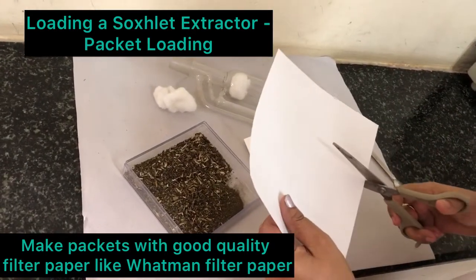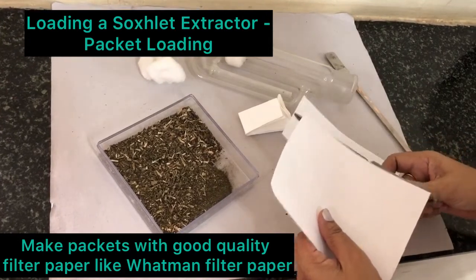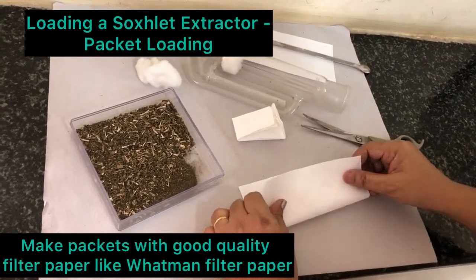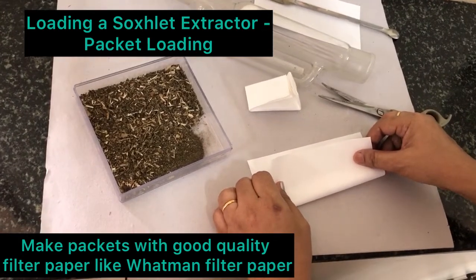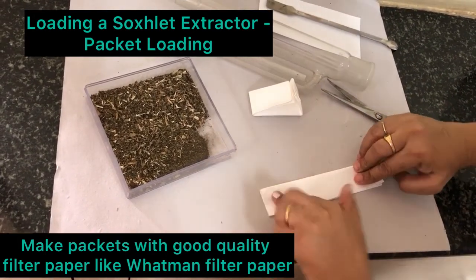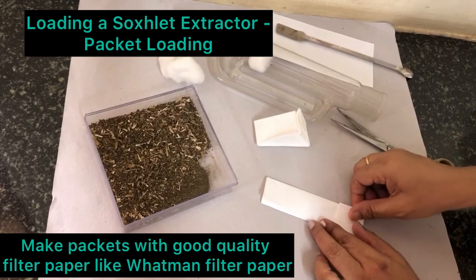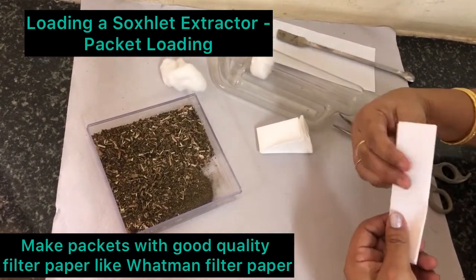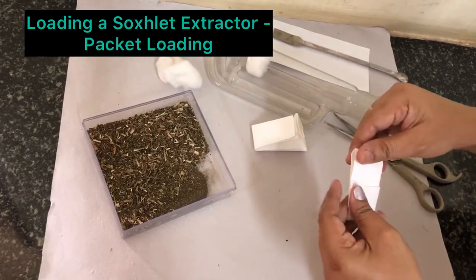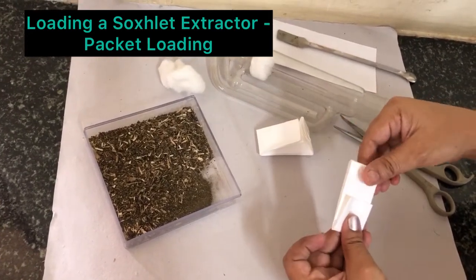You have to cut the filter paper. Keep it like this. Then fold another half like this. Fold one fourth like this. And then a bigger portion — a bigger fold inside like this. It has to go inside like this.